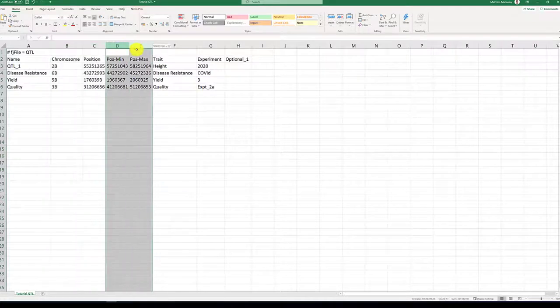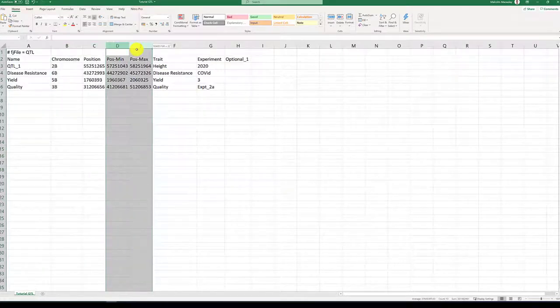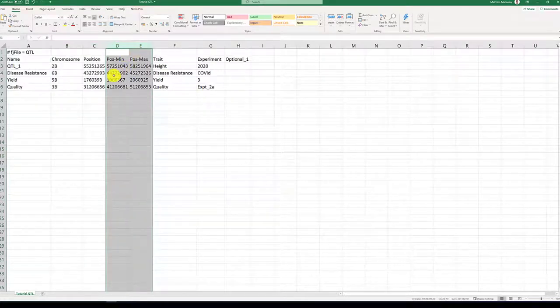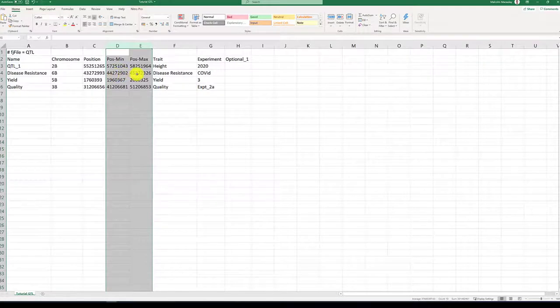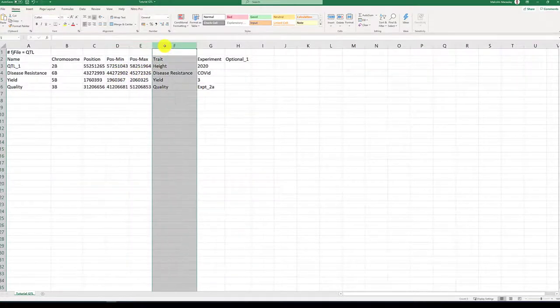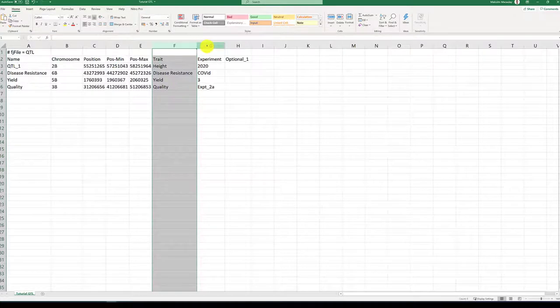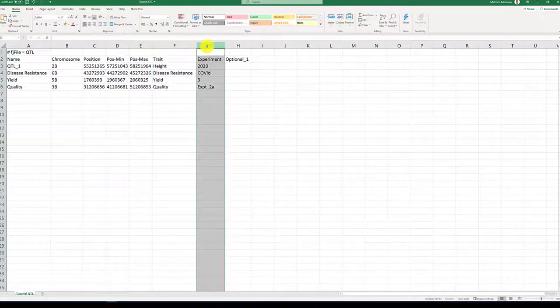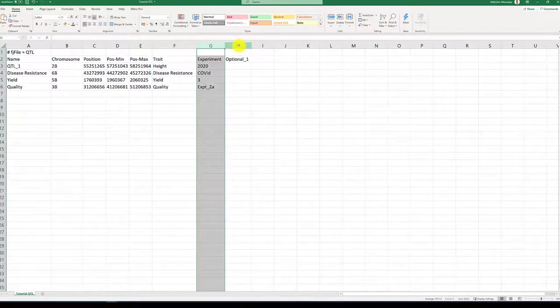Columns D to E, position minimum and position maximum, refer to the range where your QTL lies on the map. Column F contains trait name and column G refers to the experiment in question.